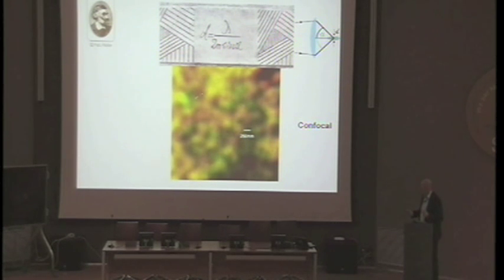As a matter of fact, here we've recorded a sample, and obviously this is a 2-color or multi-color kind of recording, but we have no clue what it is. You say 250 nanometers, this is the resolution limit here in the confocal microscope. And the structural details that are in here are much finer. No way to see what it is.